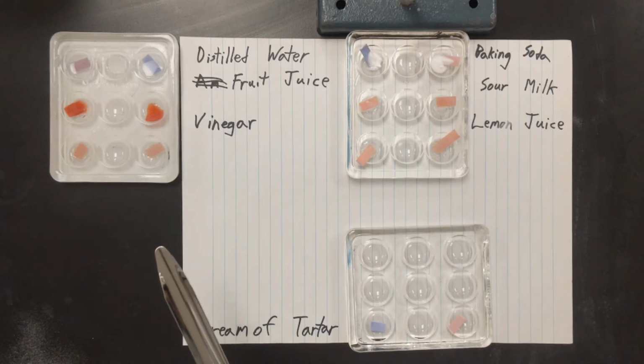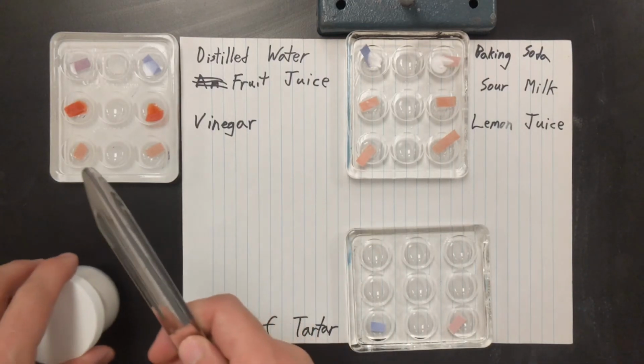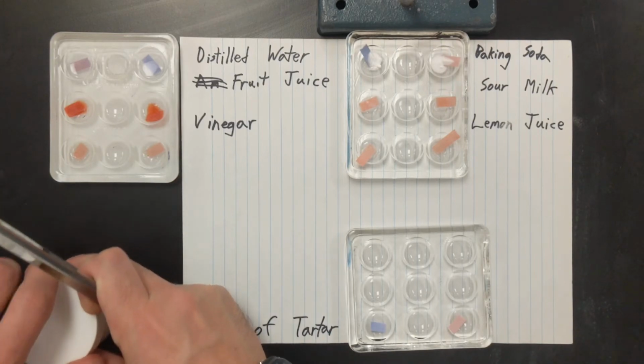Now, before I can use this for cream of tartar, I need to rinse it off. So I'm going to do that with regular water, and then I'm going to use distilled water, then I'm going to dry it. The reason for that is that the regular water gets rid of the worst of the chemicals or the substance, in this case baking soda, and then the distilled water gets rid of the tap water, which is going to have some chemicals in it, like chlorine and fluoride, and therefore it's going to introduce other variables that we don't want to introduce. So that is a clean and dry spatula, or a scupula. Sorry, scupula. I love that word, scupula.